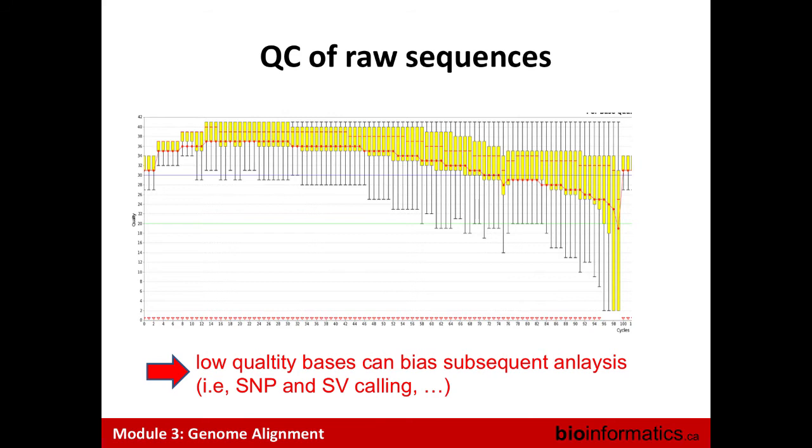Yes? Can you do this for PacBio, or is it just for Illumina? You can do this for everything that has quality associated, every FastQ. Can you do this for PacBio? Yes, because PacBio has a quality, so you can generate it. But if I remember, it depends on which version of PacBio. If you use RS2 or if you use Sequel, it's not the same format, but you will probably have to do some file manipulation to generate a FastQ, and then you will be able to.